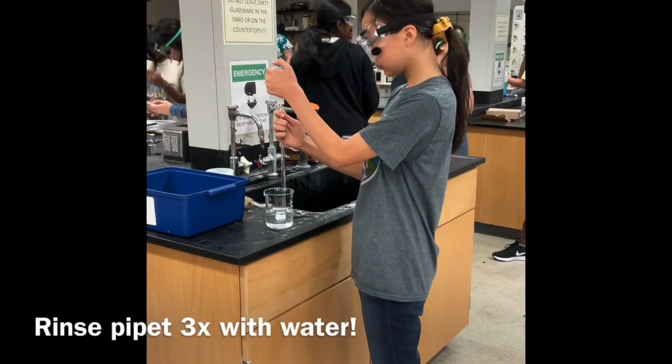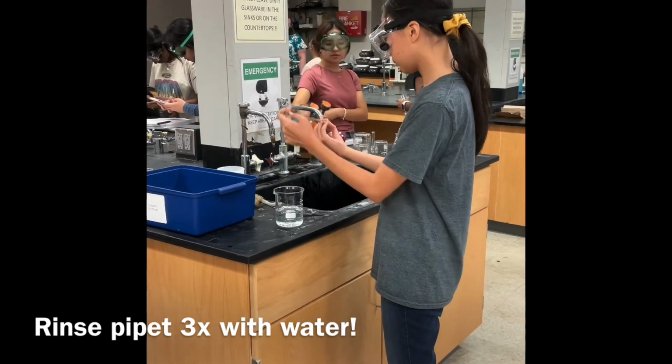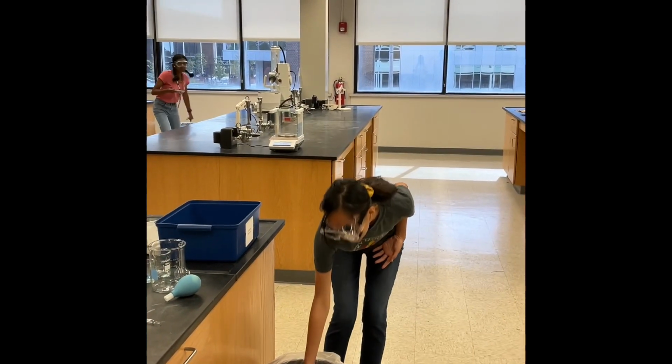After the experiment is over, we begin the cleanup process. First, we properly disposed of the solutions down the drain after checking with our lab proctor about disposal. It's important to note that not all solutions can go down the drain. Some must be disposed of in their proper chemical waste containers.